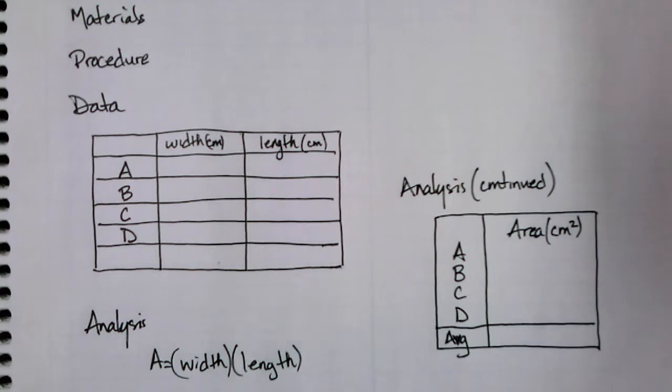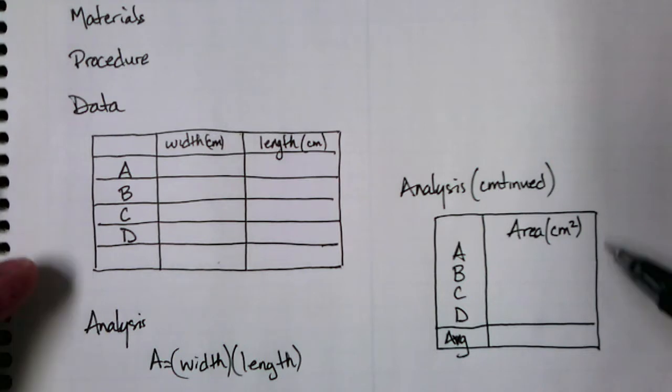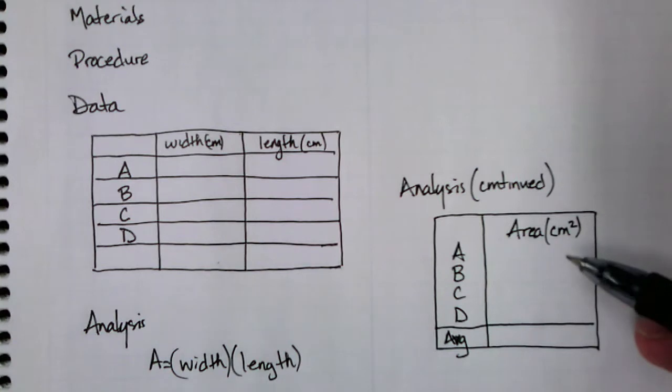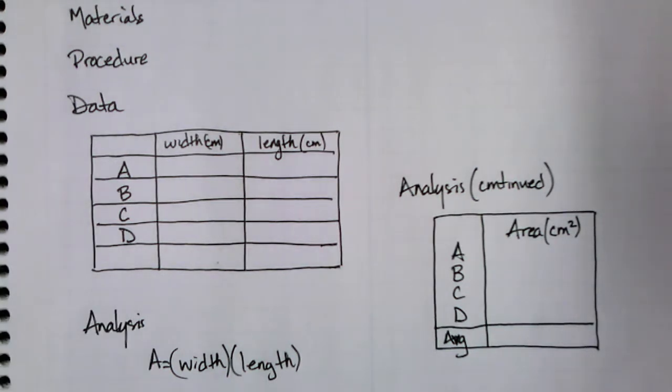If your lab produces sheets from the printer, like you're going to print out your data that is collected automatically using a lab computer, and that's printed out, you can put those printouts here in your lab notebook. Typically what they would do is actually tape it in or affix it to the lab page, but I'll have you copy it from the printout into here and have you save the original printout.